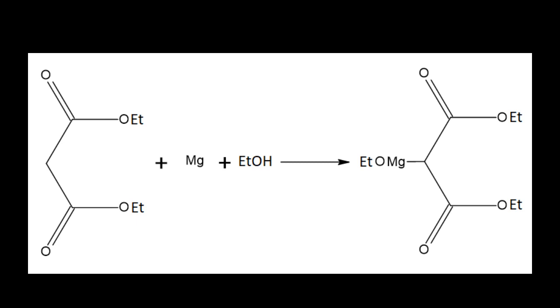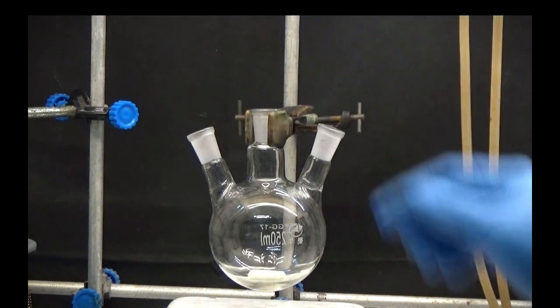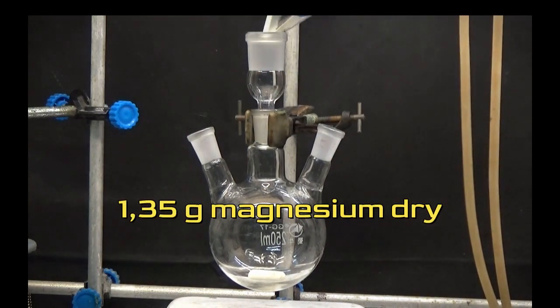Once the benzoyl chloride is obtained, we will prepare the organic compound with diethylmalonate and magnesium. In a 250 milliliter three-necked flask, place 1.35 grams dry magnesium metal.